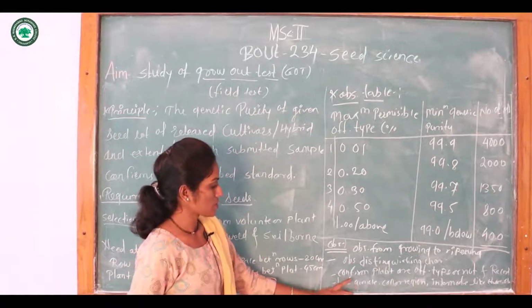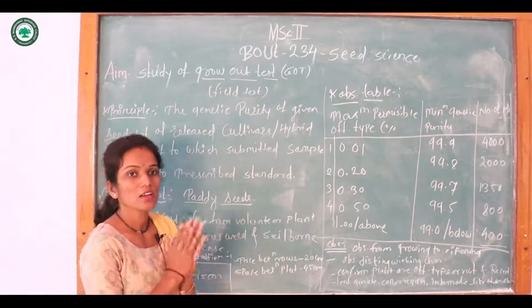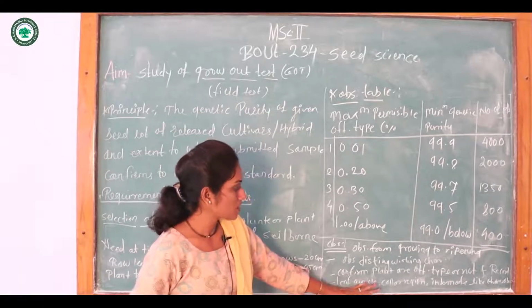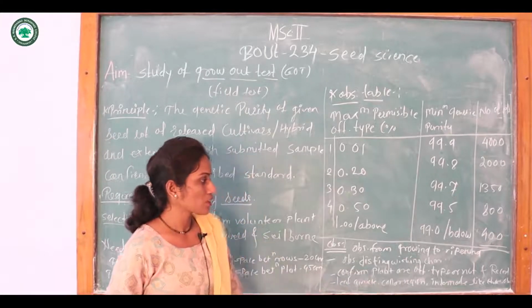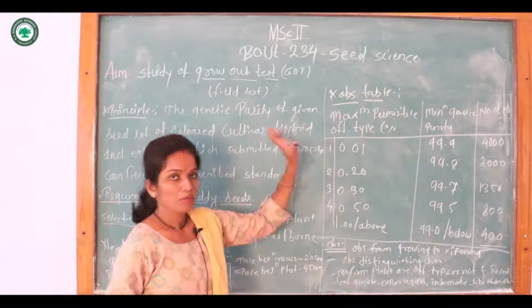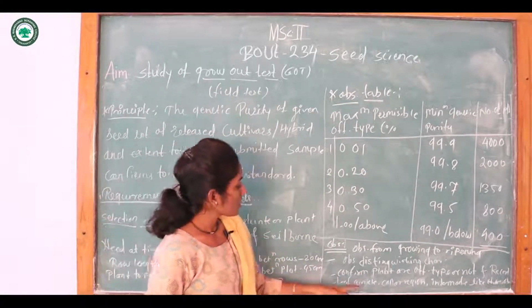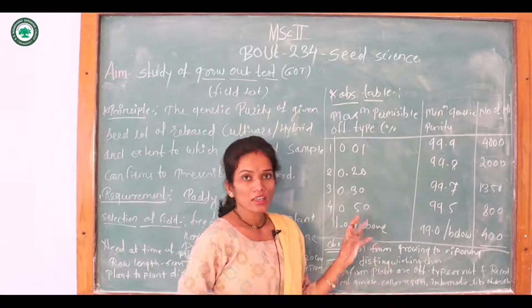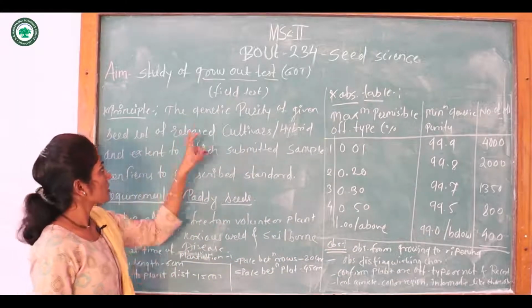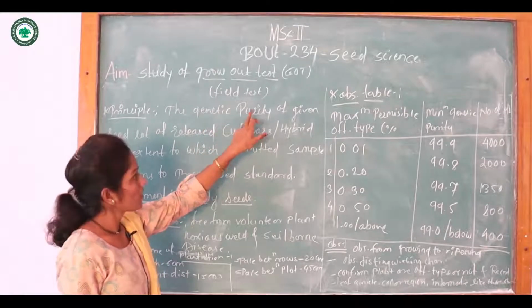And the last observation is that we have to observe the entire morphology, that means the leaf auricle, collar region color, internode color and similar characters, at the time of the genetic purity test. If the observed characteristics are normal, then we can say that the plant we planted is genetically pure, or it formed a pure seed lot. Okay, thank you.